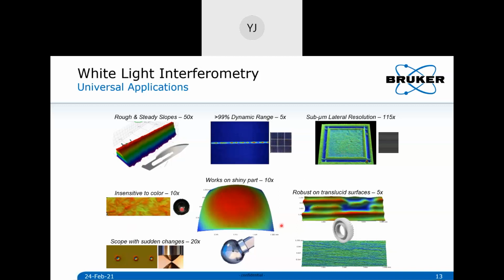And you can see different shapes as well, right? Like you have the gears, you have these spherical shapes. I think it's a part of an implant, and you also have different indents on your sample.